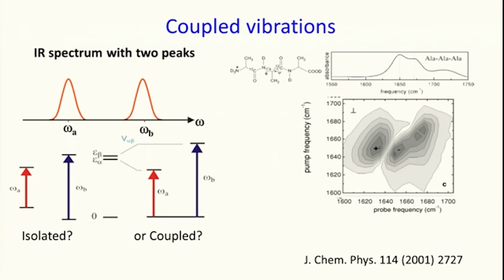What you see is that this 2D IR spectrum is actually a 3-dimensional plot. On one axis we have pump frequency, on the other axis we have probe frequency. There is a third axis pointing out of the projection towards you or towards me. That axis gives you the intensity or absorbance, whatever you choose to plot. So, whenever we have a 3-dimensional plot and we have to draw it on a 2-dimensional surface, it is most convenient to show it as contour diagrams. These contour lines essentially join all points where absorbance or intensity is the same.